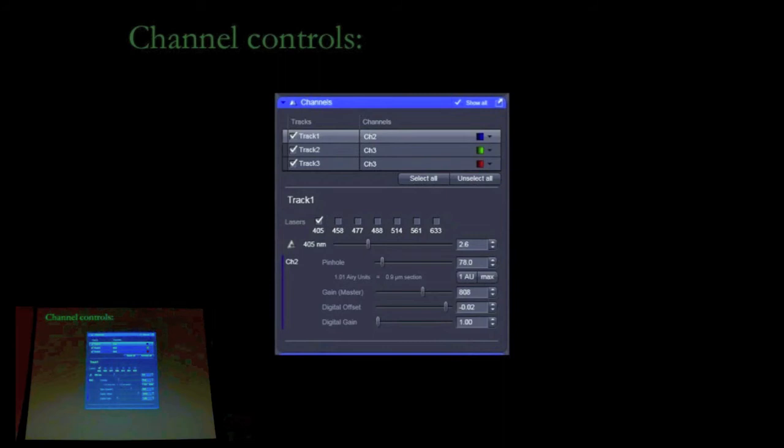The buttons are handy calculators for optimal highest resolution, but your mileage may vary. If what you need to see isn't right at the diffraction limit, then you can tweak things to optimize the performance for what you need to see.